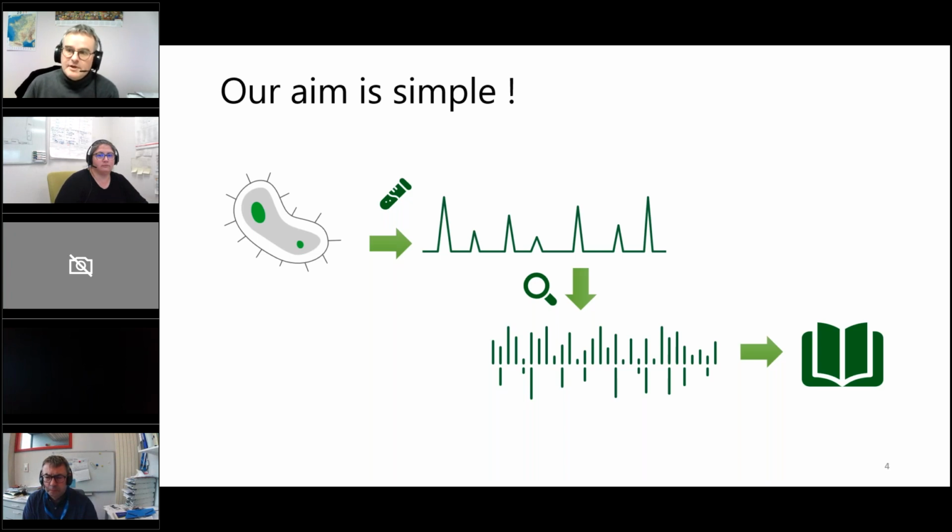And usually today, high resolution mass spectrometry affiliated to liquid chromatography, but can be GC, can be CE. And in the end, we want to have a nice report with molecule names and when we can, we also want to add to that some quantification data.